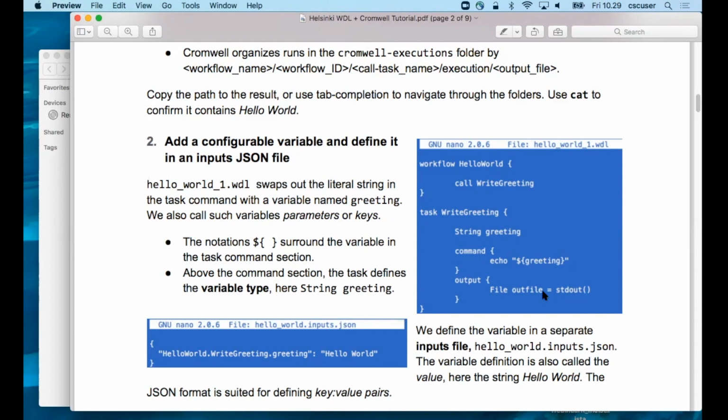I'll show you how to do standard error in a second. And I will say, this is the hello world of echoing something and looking at standard out. It is not a typical thing that you do in bioinformatics, honestly. It's kind of a toy thing to just run the very first commands, something super simple. Most of the time, we're going to explicitly write to text files.